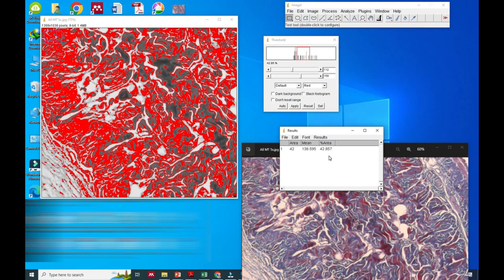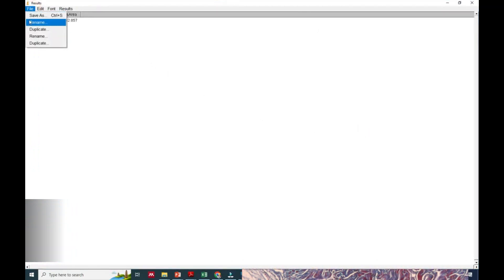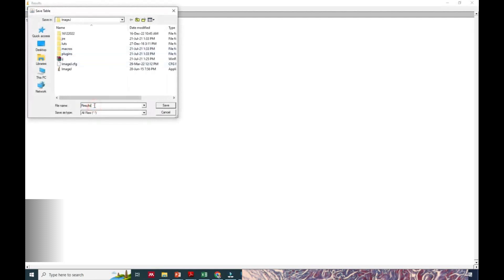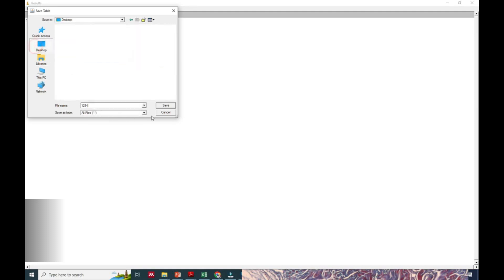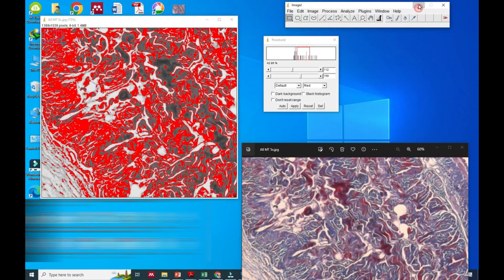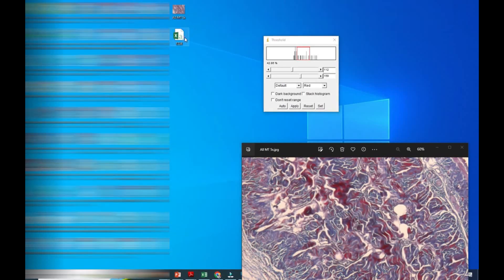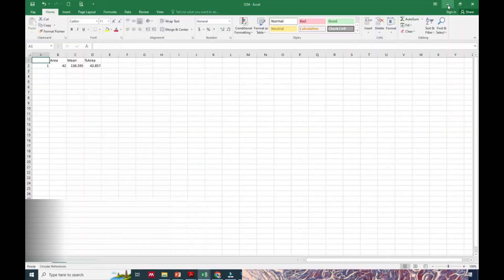This is how we can save it on the desktop by giving it a file name. It will give the Excel file. Here you can see it has given the Excel file results.